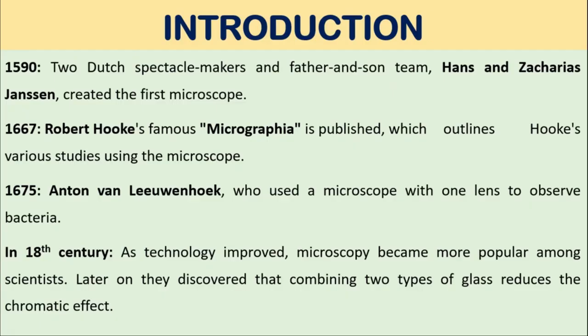Introduction to microscopy. In 1590, two Dutch spectacle makers, father and son team Hans and Zacharias Janssen, created the first microscope. Then, who is the father of microscopy? Zacharias Janssen is the father of microscopy.